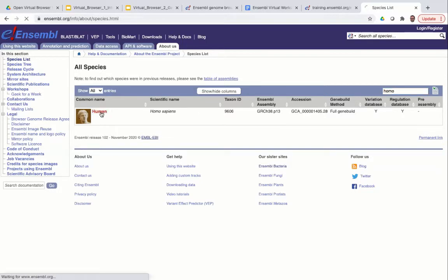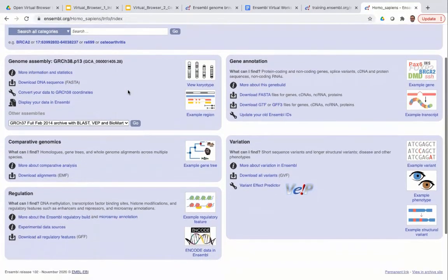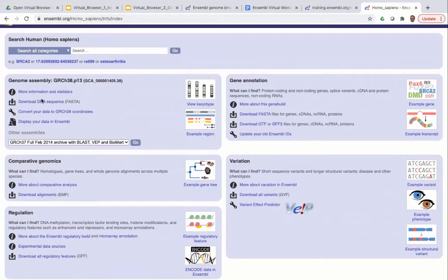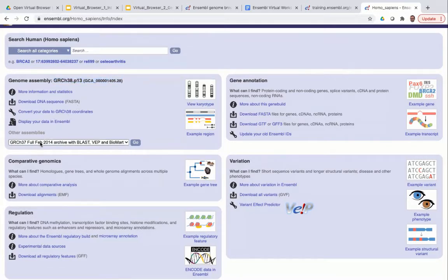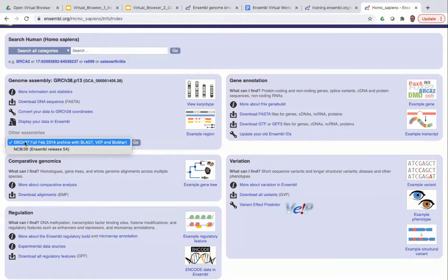You can see information about the human genome assembly and accession number. Clicking on human takes you to a species-specific homepage with a search bar at the top, as well as information about the gene annotation, variation data, comparative genomics, and regulation data. In the top left corner is information about the genome assembly — we're looking at GRCh38 with the accession number shown. At the bottom of that box is a link to other genome assemblies available, including NCBI36 and GRCh37. Selecting GRCh37 and clicking go takes you to a dedicated archive at GRCh37.ensembl.org.